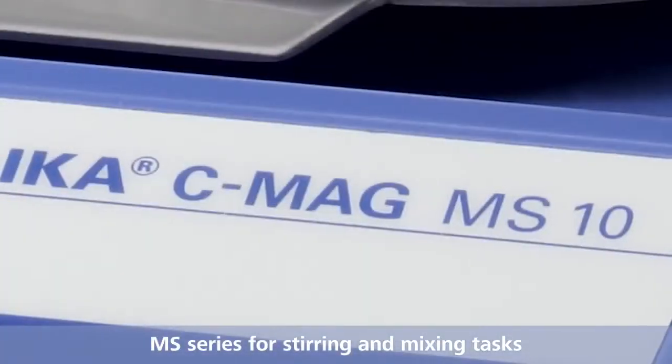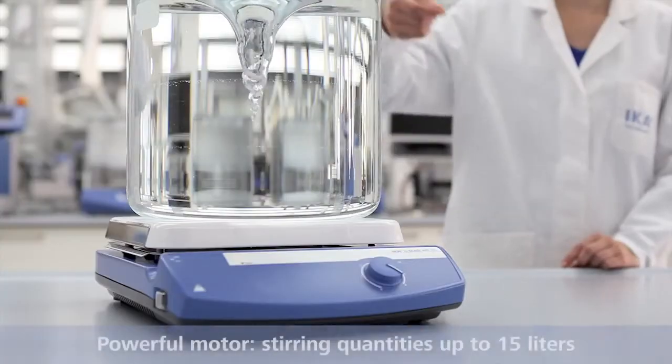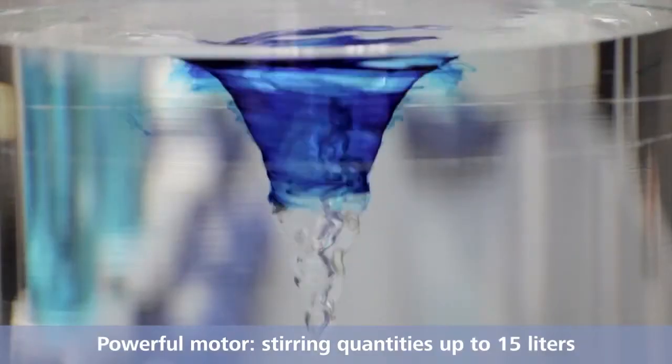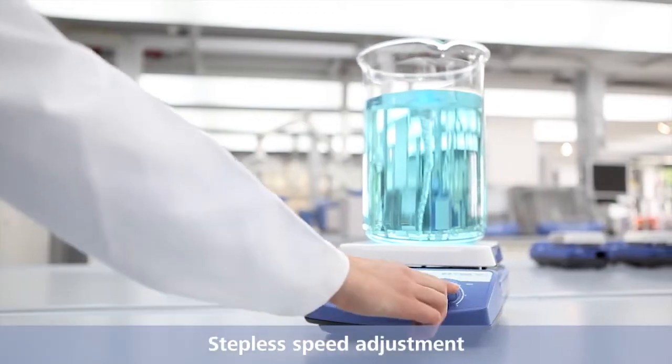MS series for stirring and mixing tasks. Powerful motor for stirring quantities up to 15 liters. Stepless speed adjustment.